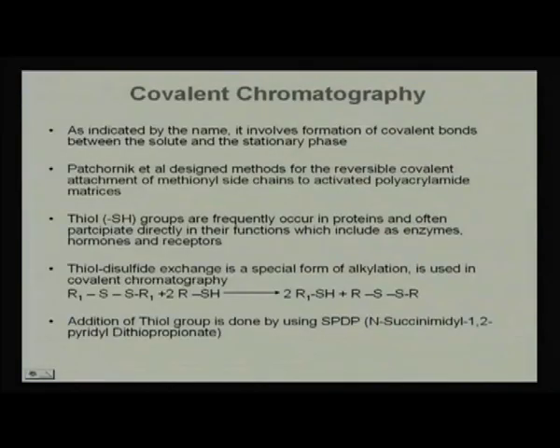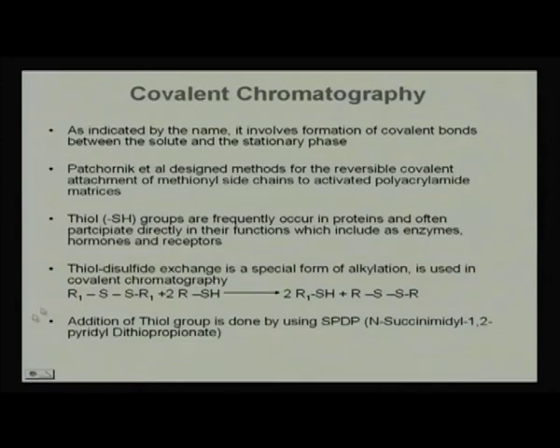Similarly, we can go for covalent chromatographic techniques, where the basis of separation is the sulfur containing amino acid. Here, the thiol containing amino acids are the major consideration for the separation of any biologicals, through the SH group or the sulfur thiol group present in the macromolecule.